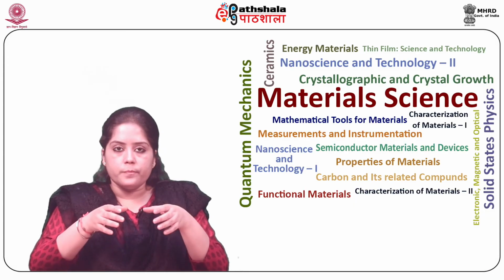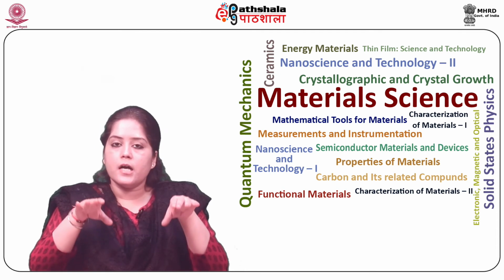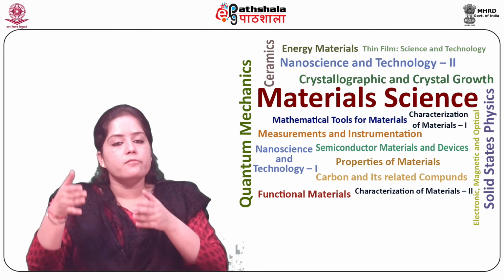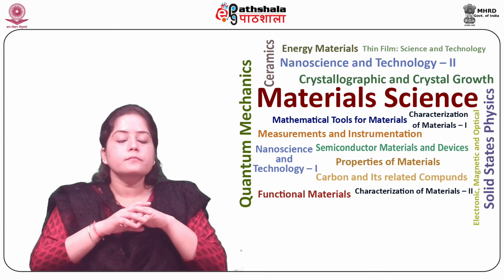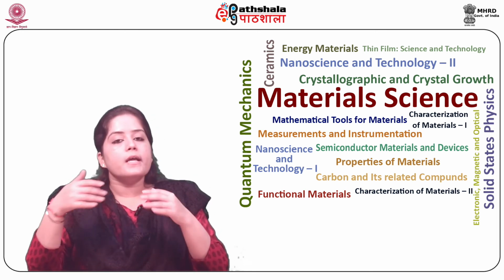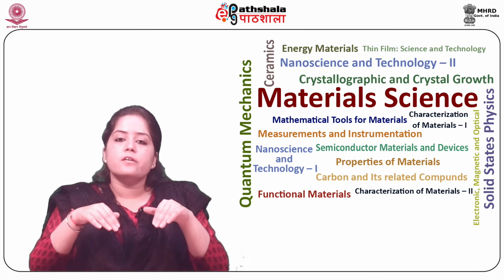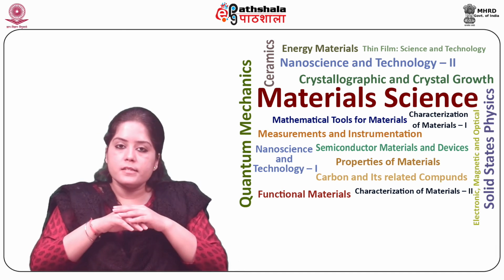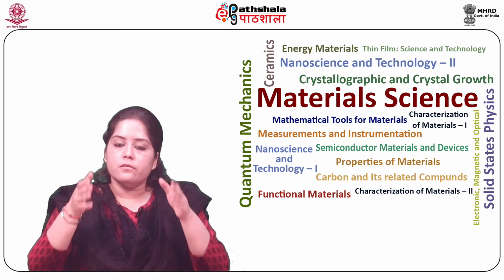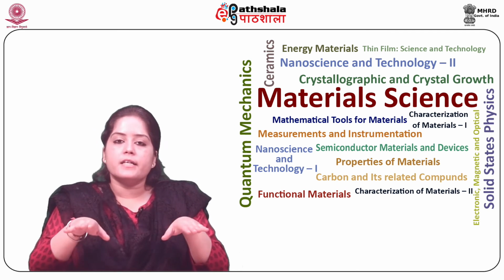For the technique to be successful, the following two requirements must be met. Number one, the sample must be in direct contact with the ATR crystal, because the evanescent wave or bubble only extends beyond the crystal 0.5 to 5 microns. Second, the refractive index of the crystal must be significantly greater than that of the sample, or else internal reflectance will not occur. The light will be transmitted rather than internally reflected in the crystal. Typically, ATR crystals have refractive index values between 2.38 and 4.01 at 2000 centimeter-1. So it is safe to assume that the majority of solids and liquids have much lower refractive indices.